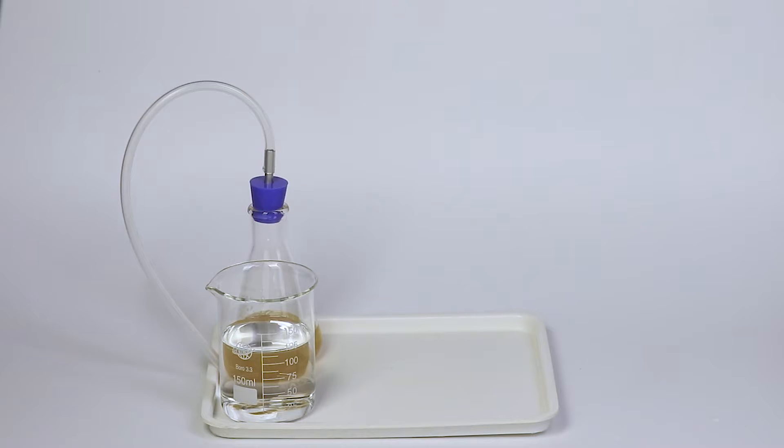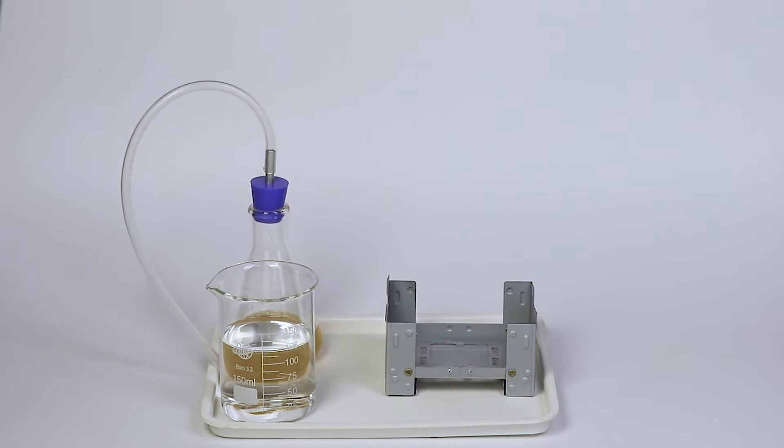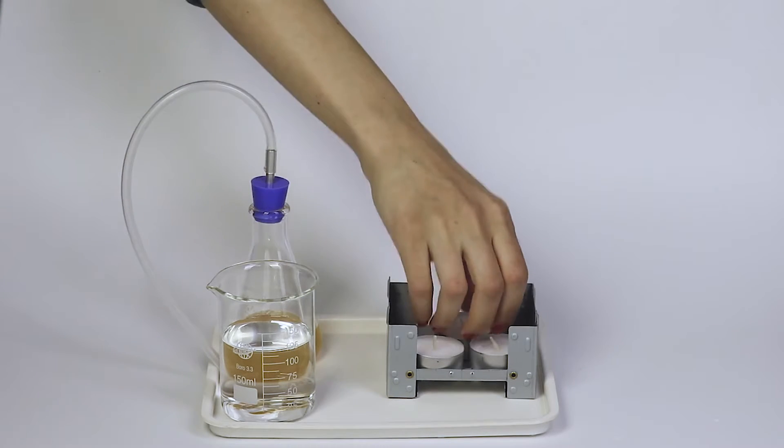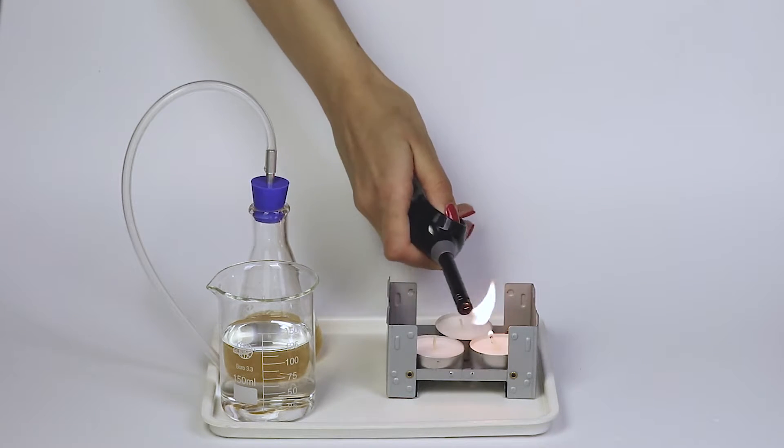Prepare the solid fuel stove. Put three candles into the stove, light them, and cover the stove with the flame diffuser.